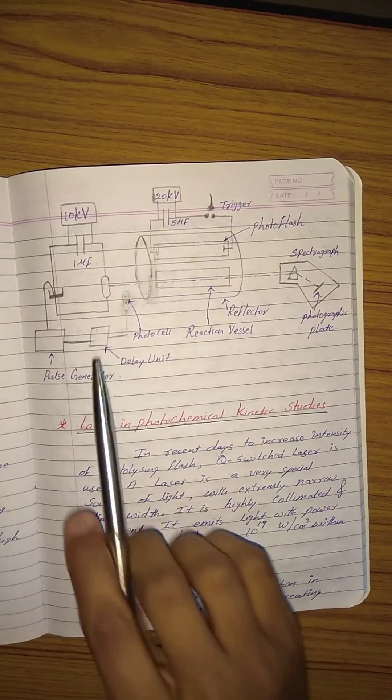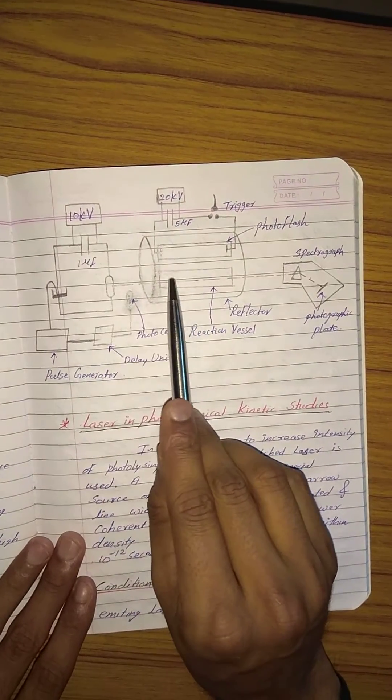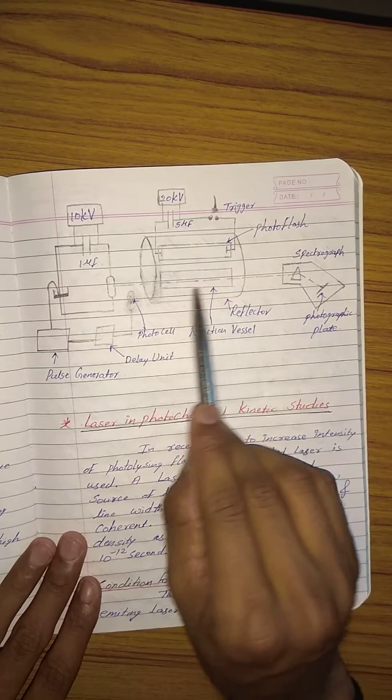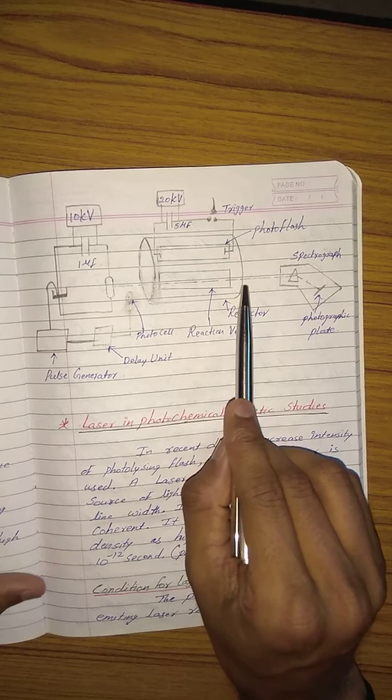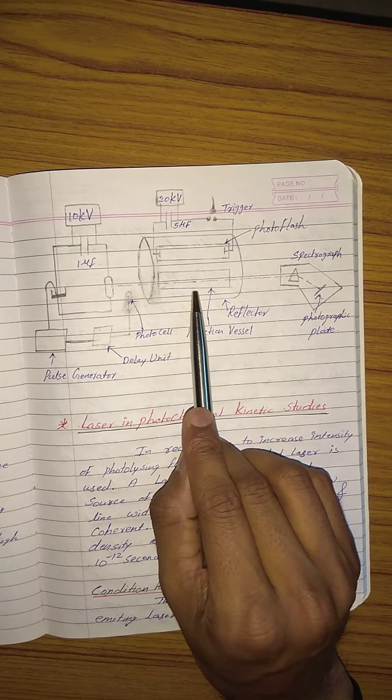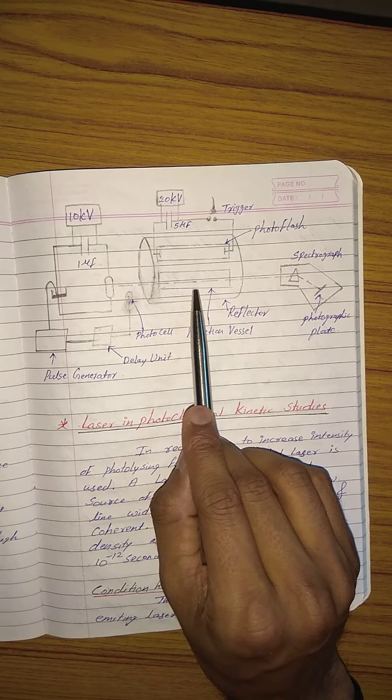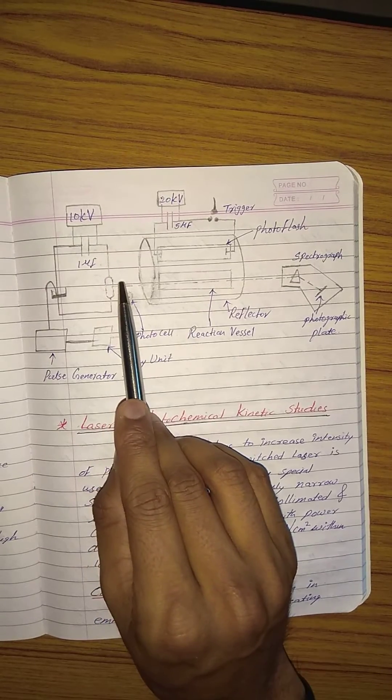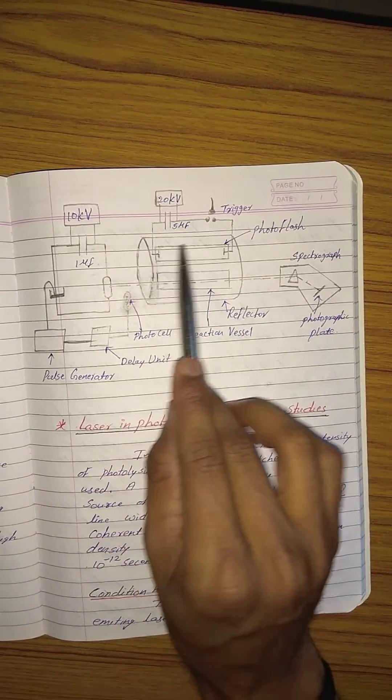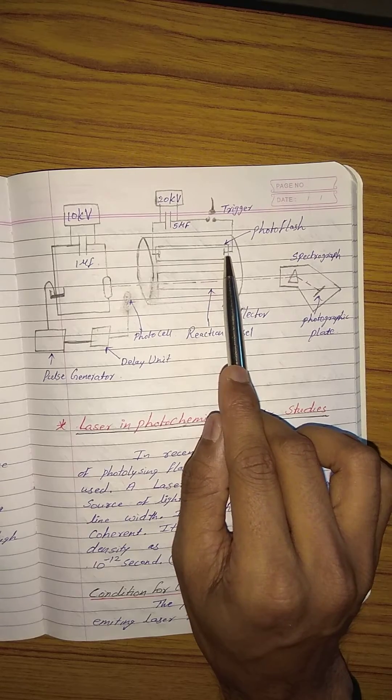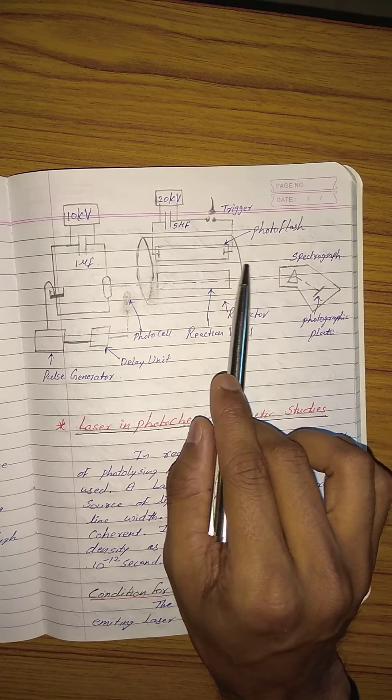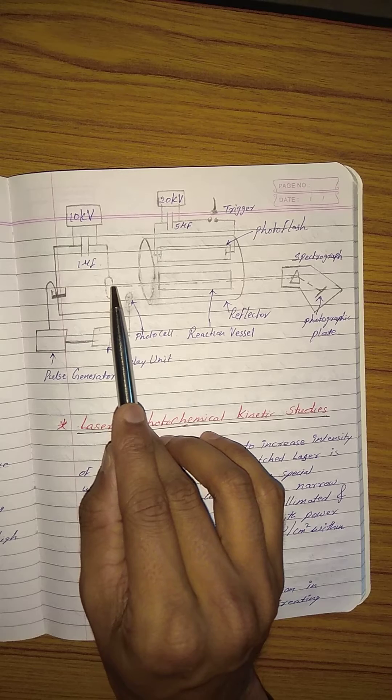This particular reaction system, also called a cell, is where the reactions are taking place. It is subjected to high intensity flash. This flash is generated from this particular tube, and the reaction is monitored using single beam absorption spectroscopy.